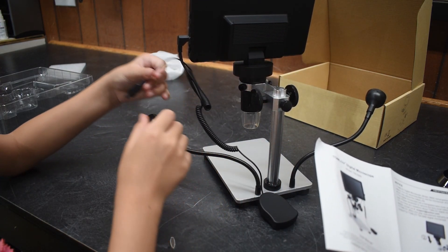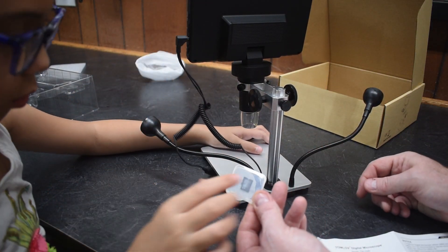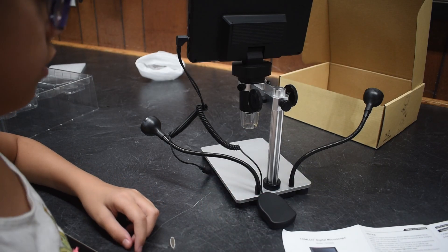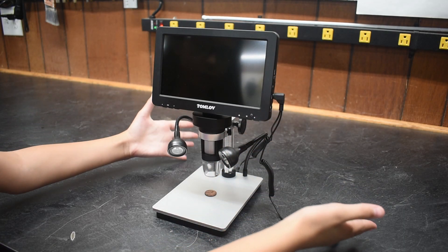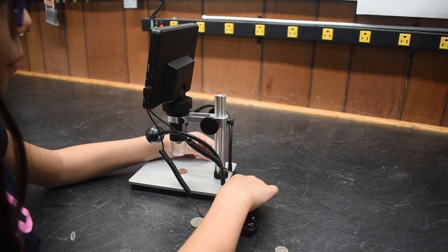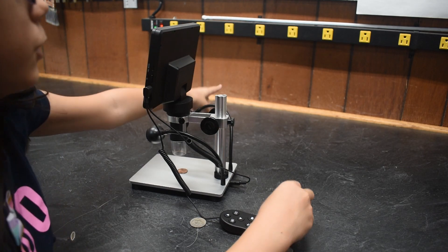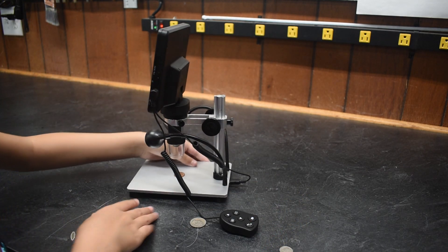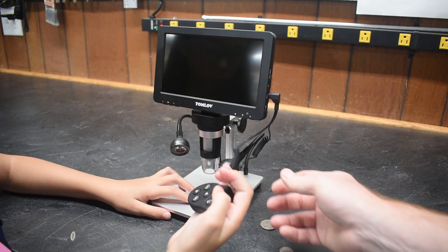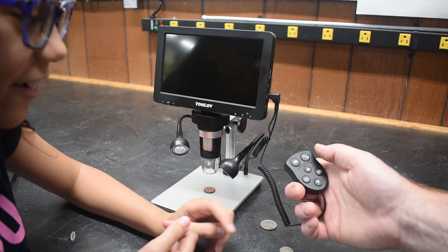Never mind, we're just gonna put that over here for later. Oh, there's even an SD card — you can store stuff there. And this is complete. There are batteries in here and that brings the power to these lights. This has some different settings and you can also record with it.